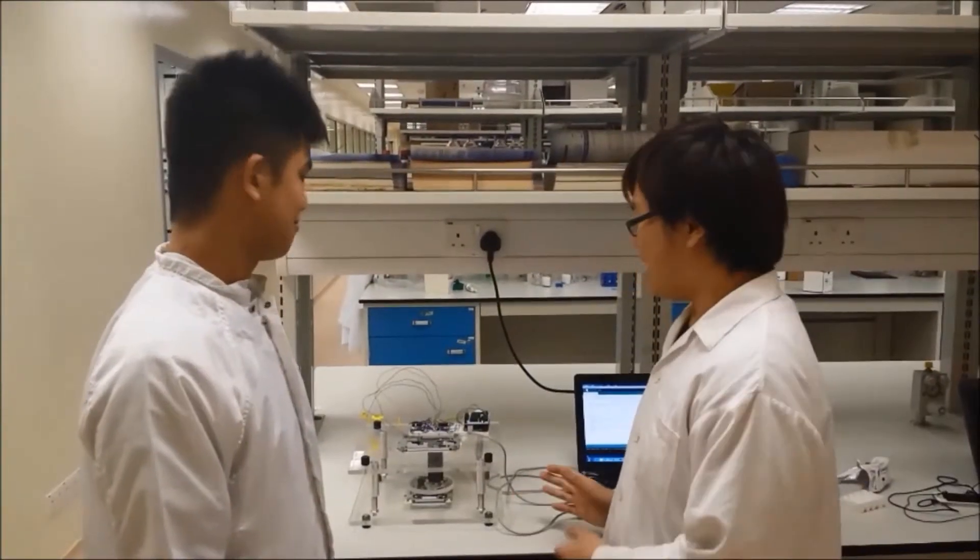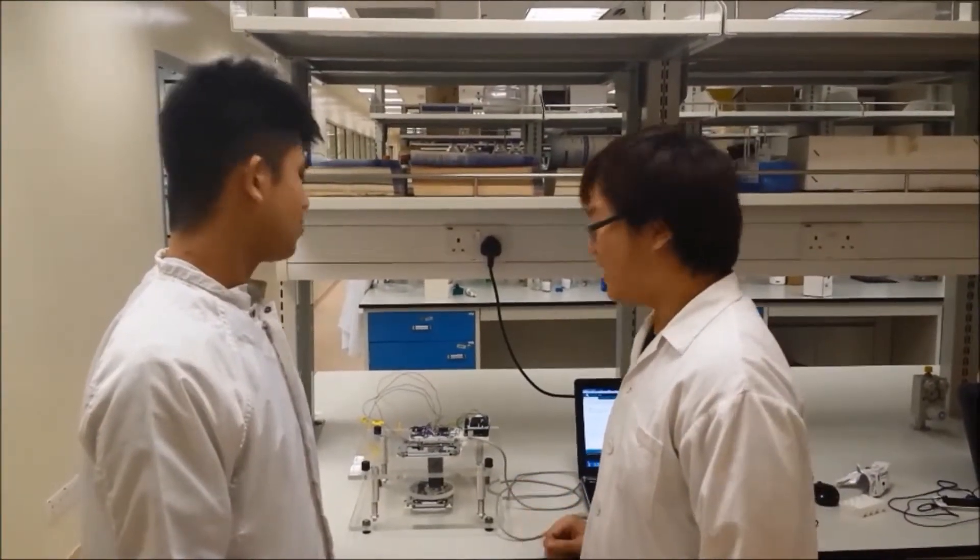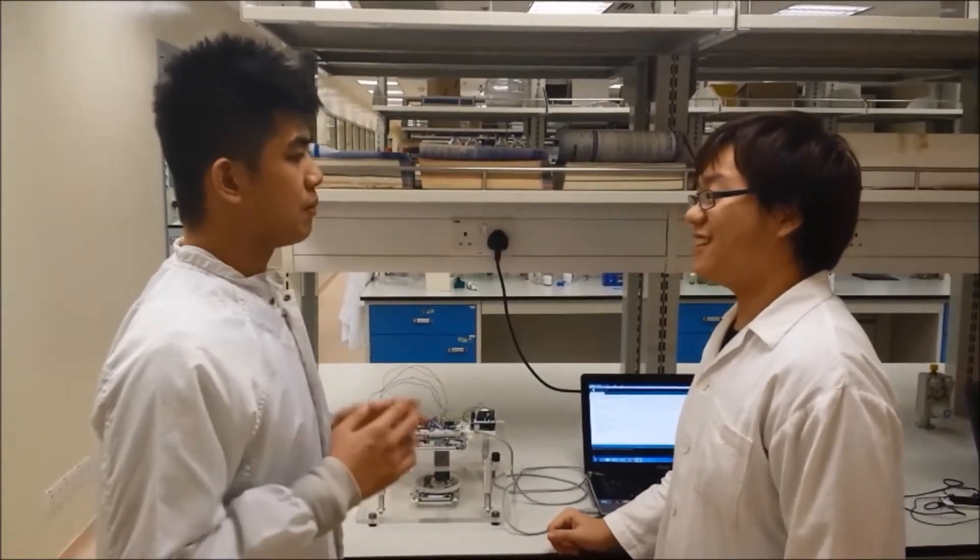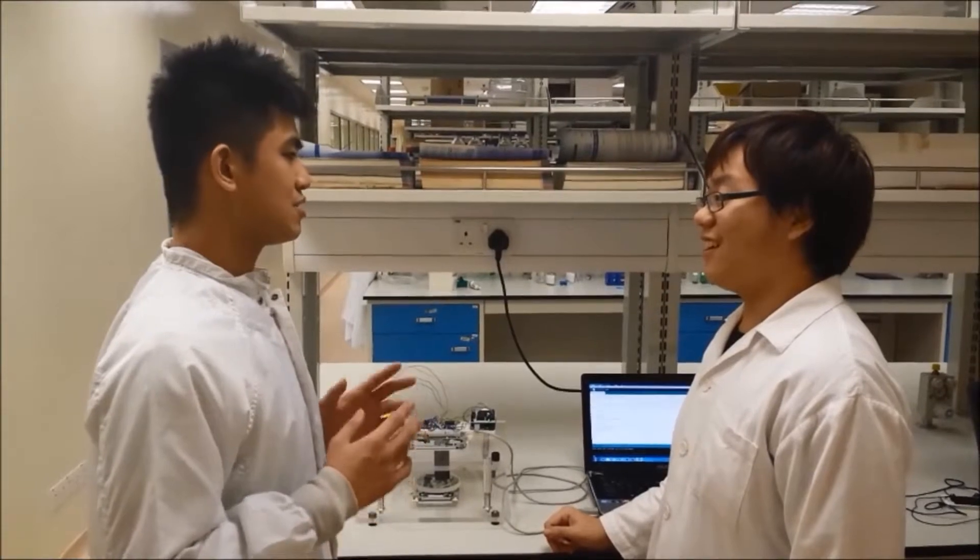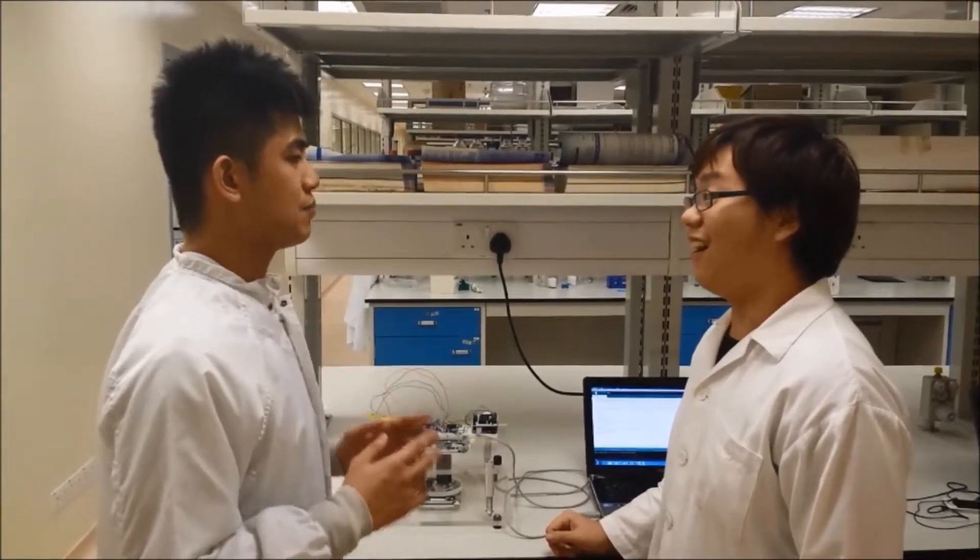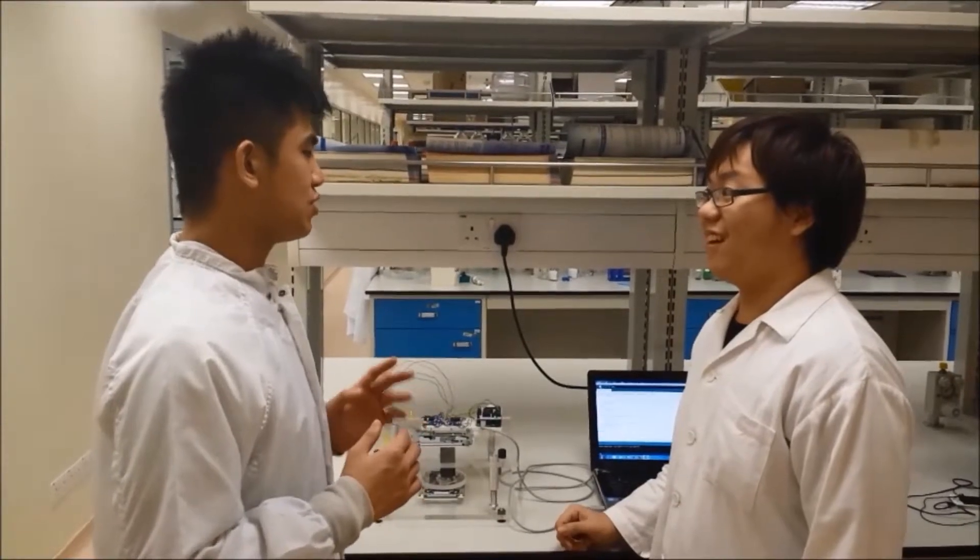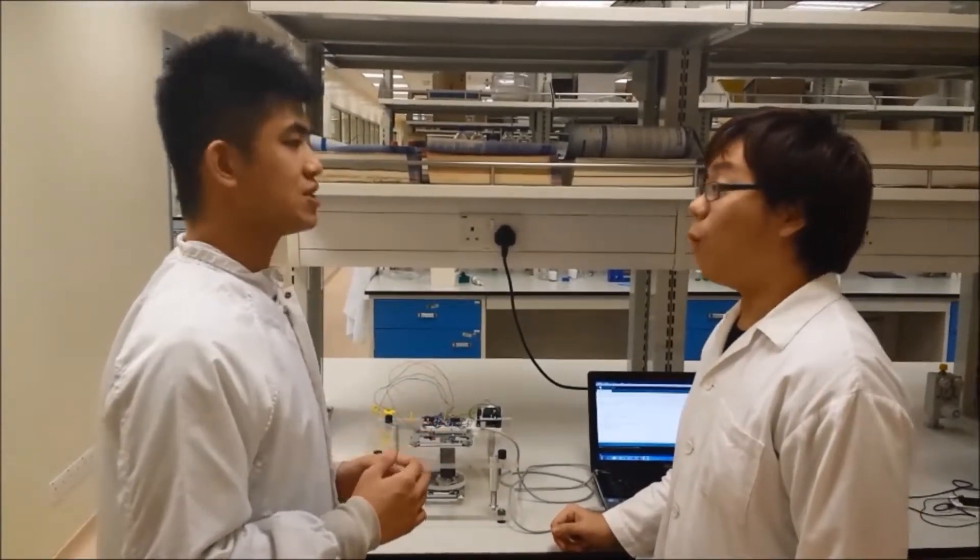So what are the promising applications for this DIY bioprinter? For our DIY bioprinter, we have plans to print out mammalian cells first and then test out the cell viability after printing. If that proves successful, we hope to be able to print out functional cardiac cell patches in the future.